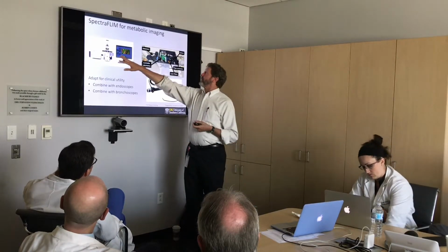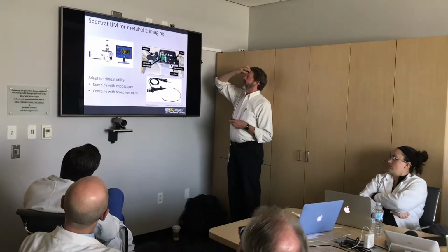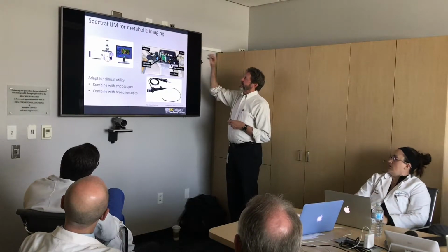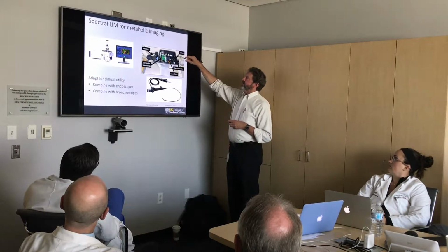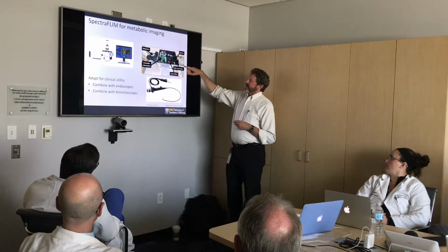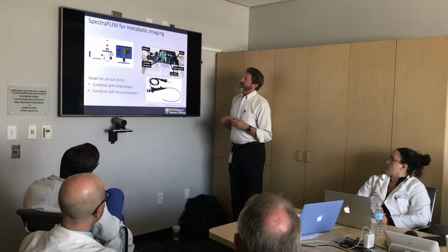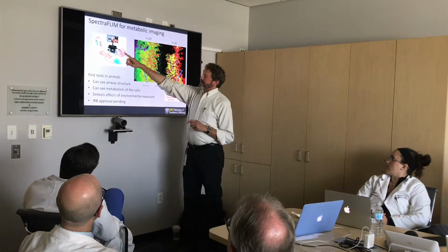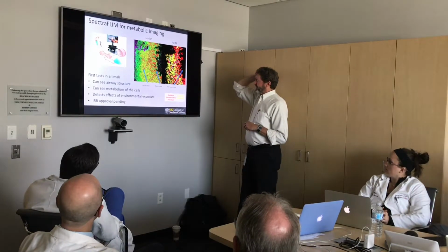So instead of our commercial scope, we've been working on a sort of semi-home built scope. A company out of Enrico Gratton's lab years ago has been making much more open architecture instruments. We've been modifying this. The idea is to couple this into the accessory port of a bronchoscope or other endoscopes and be able to see things. So that's sort of our dream. We are getting pretty close. I think that the paperwork is almost there.